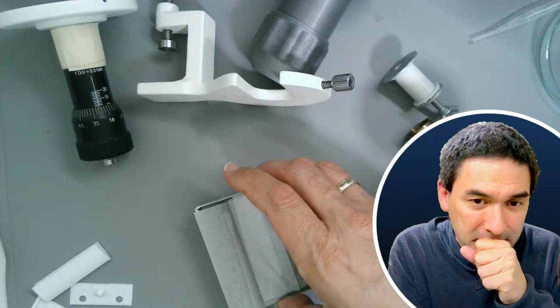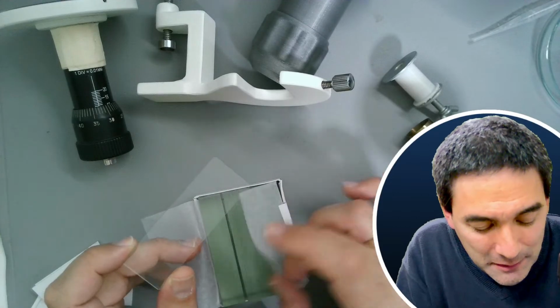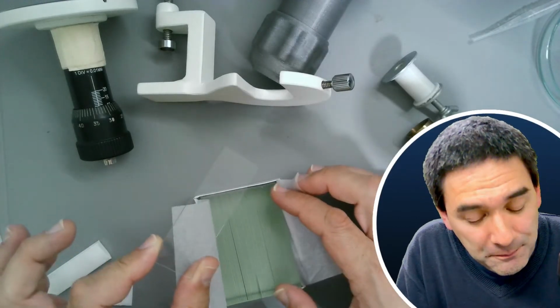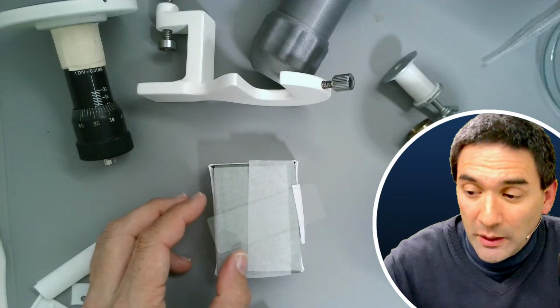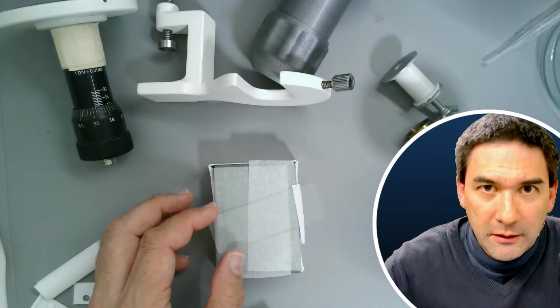Excuse me. Look at those slides here, let's talk a little bit about slides as well, not just about microtomes. I like those slides because they're clean and they're ready to use. I do have other slides as well, which I'll show you, which were significantly cheaper.